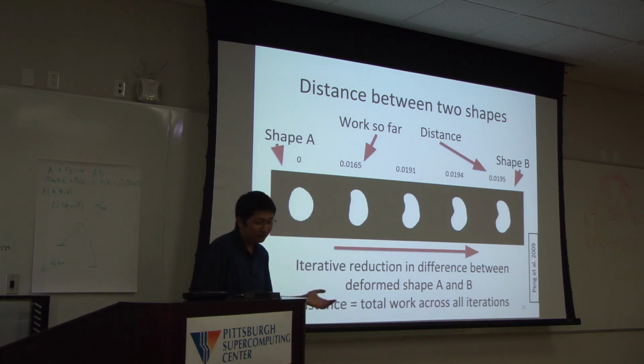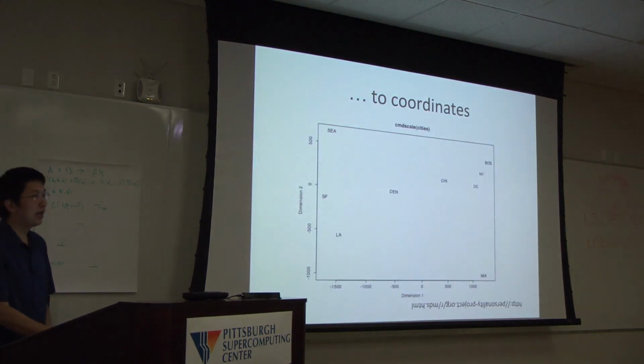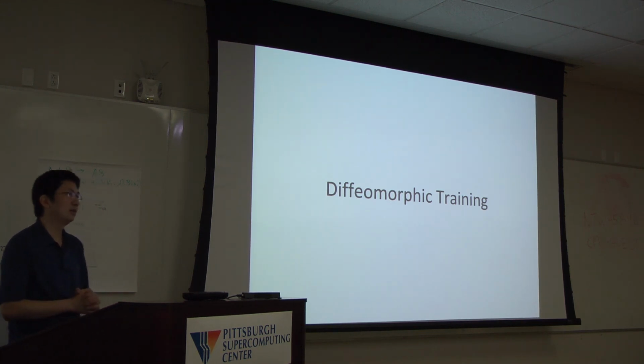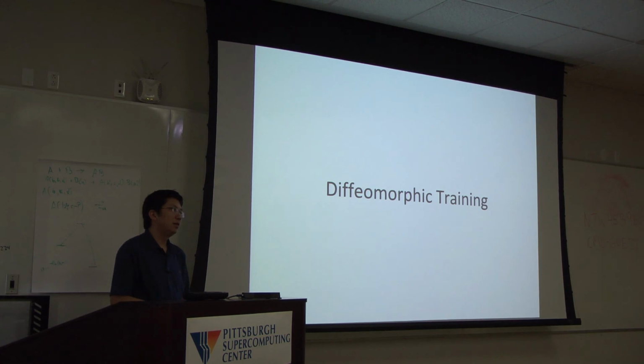Yeah, for visualization purposes, we only show a shape space of 2D. In practice, we can build a shape space for higher dimensions, like 3D. By default, we use 7 dimensions in Cell Organizer. Usually we don't use just 2D. We usually use 7D or higher, because it can capture more variance of the cell shapes.